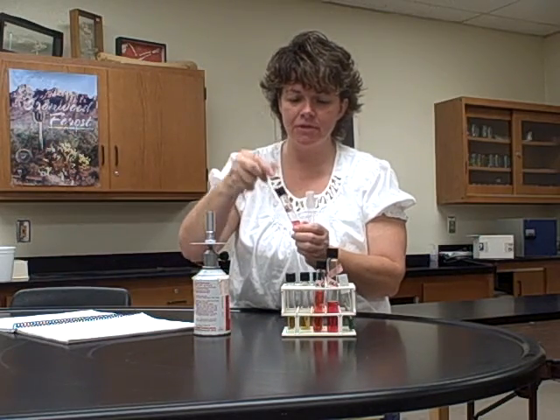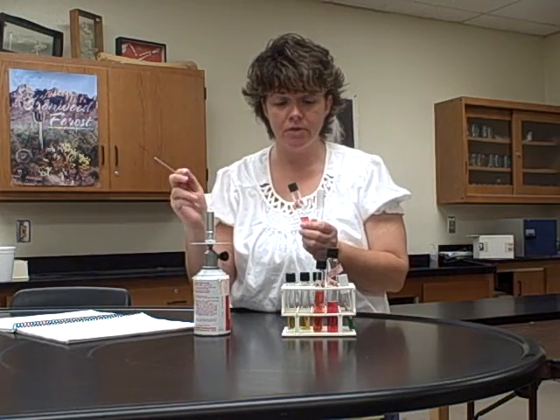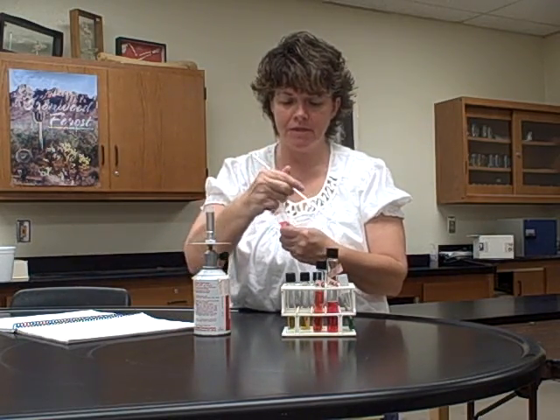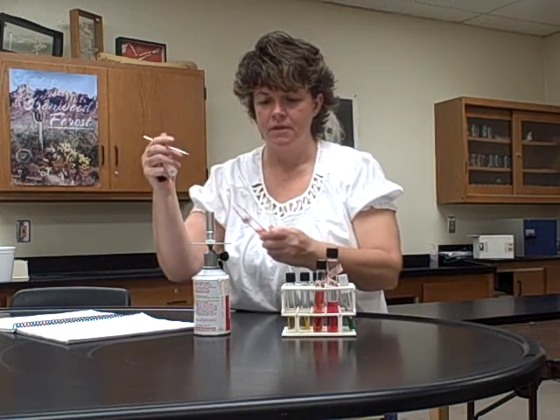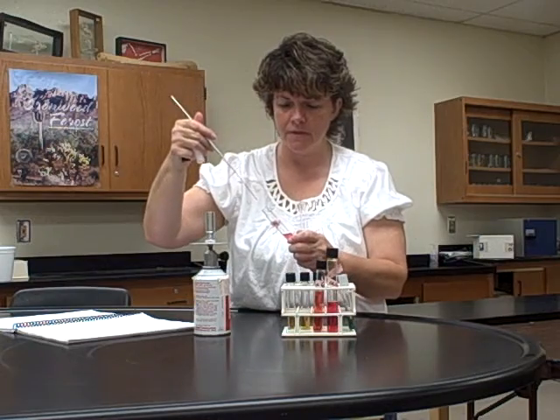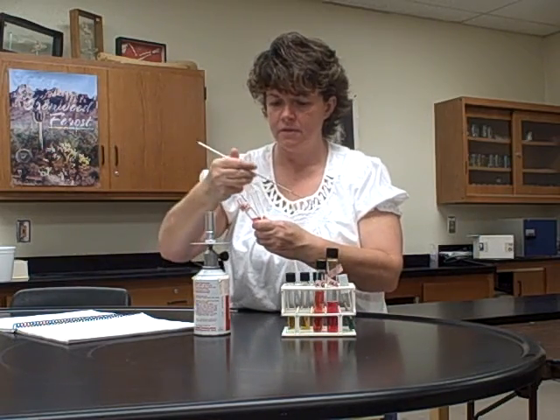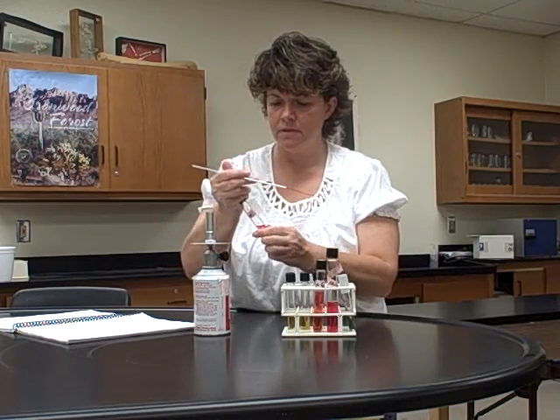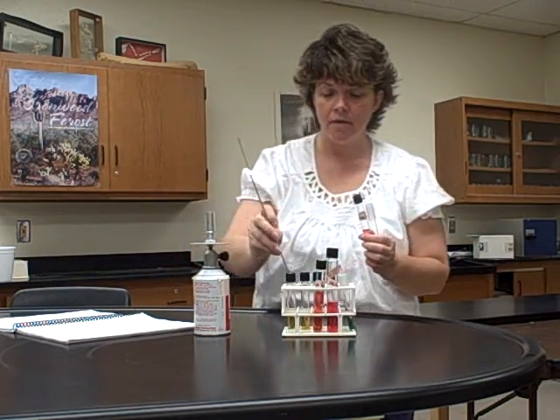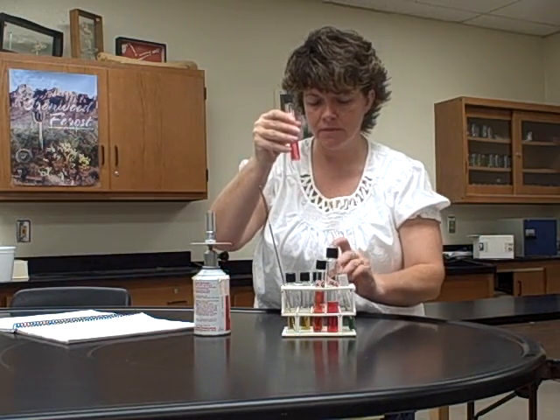I'm going to loosen that a little bit before I start grabbing with my fingers. So I've already sterilized my loop and it's cooled down. So I'm going to take my lids off. I'm going to go into my culture like I've always done, and then go into the new one. Okay, sterilize my loop.